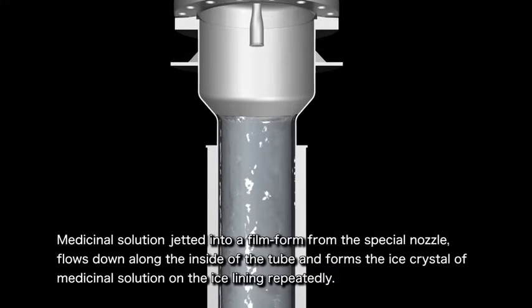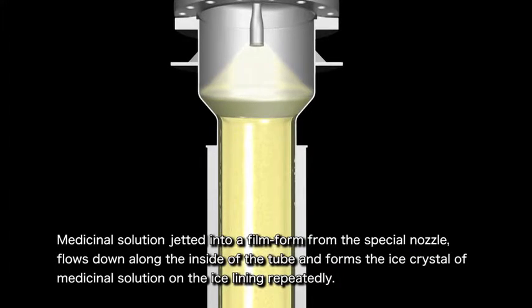Using this enlarged image, let's take a closer look at the medicinal solution freezing process. The solution comes out of the special nozzle at the top of the tube and flows down along the tube's inner surface. The medicinal solution then freezes on the cooled inner surface of the ice lining by repeatedly forming ice crystals.